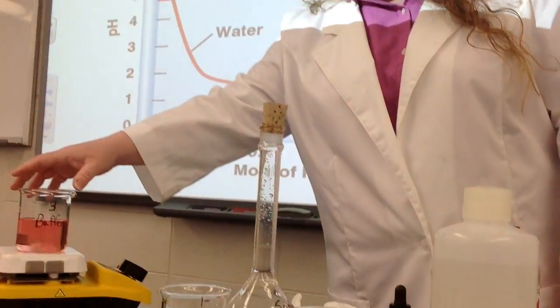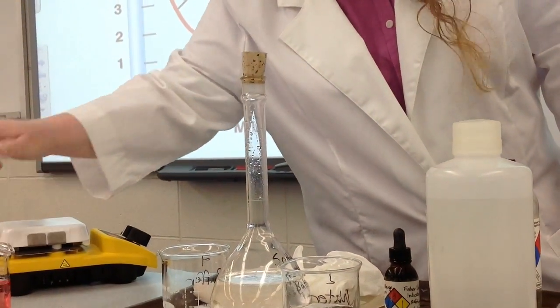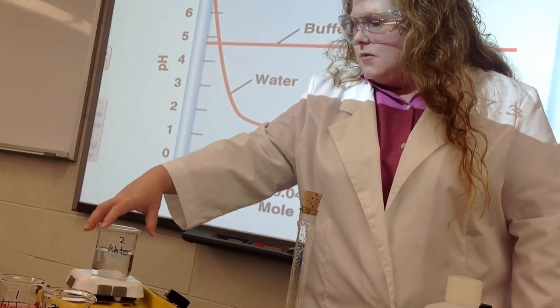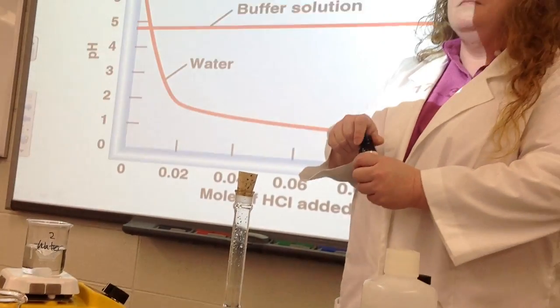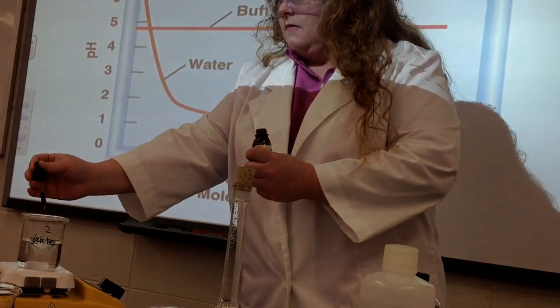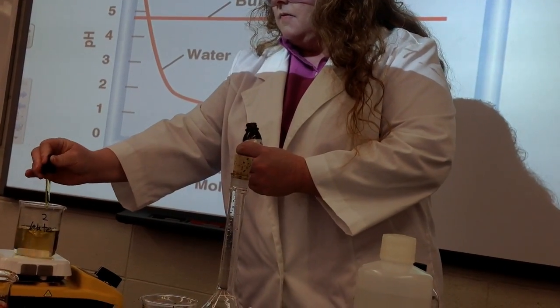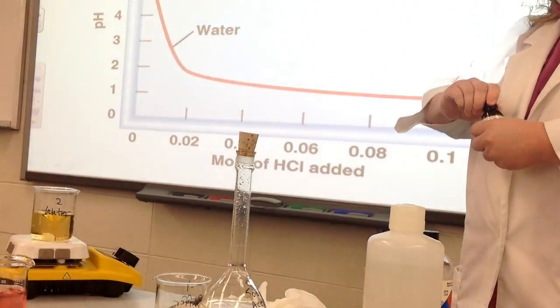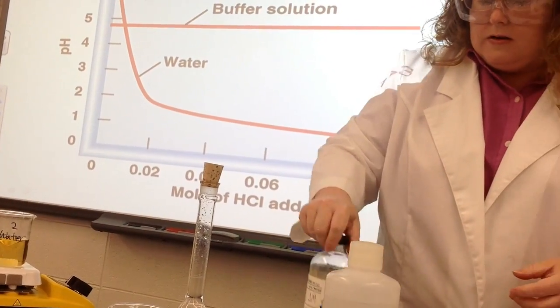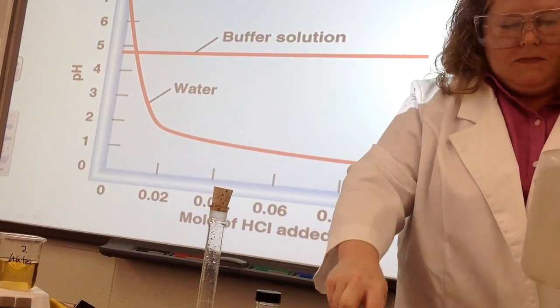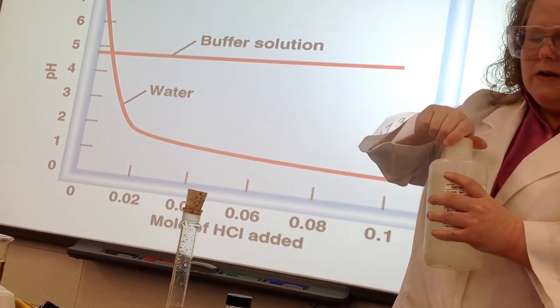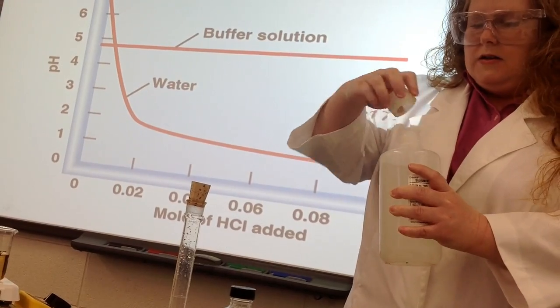Okay, all right, so let's take a look at adding a base to just some plain water first. So again, let's add some indicator. This is just distilled water again. Nice yellow color, so again it's yellow because the pH of the water is about five, five and a half. Okay, I've got some one molar sodium hydroxide here, so we know sodium hydroxide is a strong base.